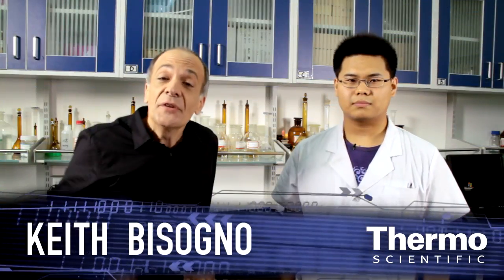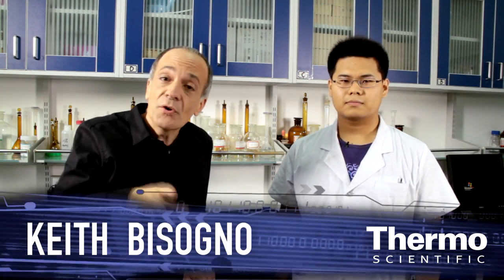We're in the chemical analysis lab, specifically testing water quality, and I'm with Li Yang. He's an expert in this area and an engineer in the laboratory.